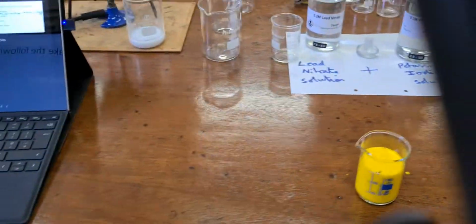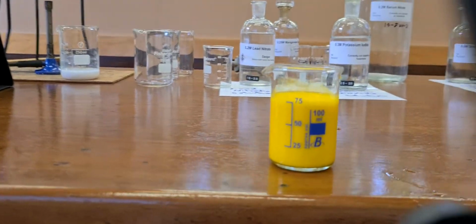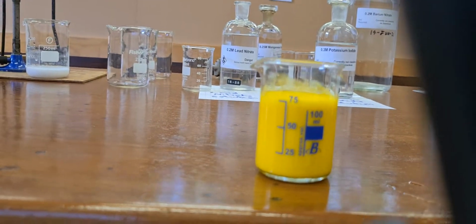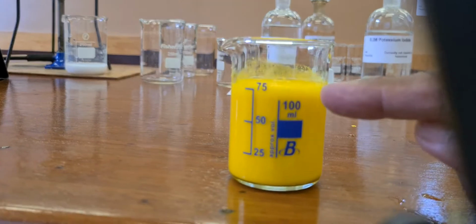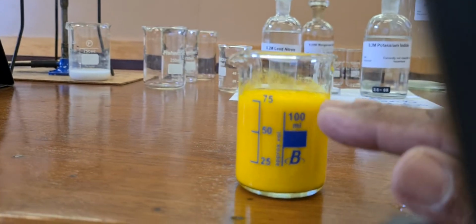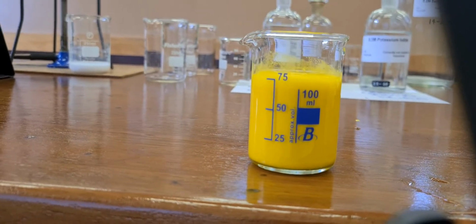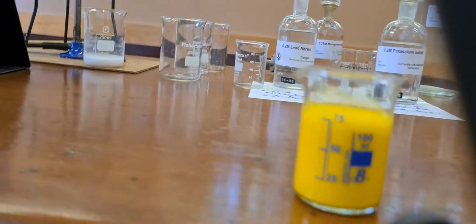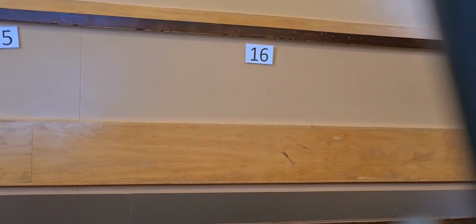And you form this lovely yellow, bright yellow, which if you keep watching it, and if I don't disturb it, the solid, this yellow solid, will settle down to the bottom of that beaker, and that's the precipitate. And we could separate it if we filter.